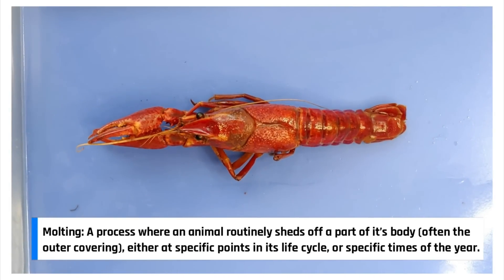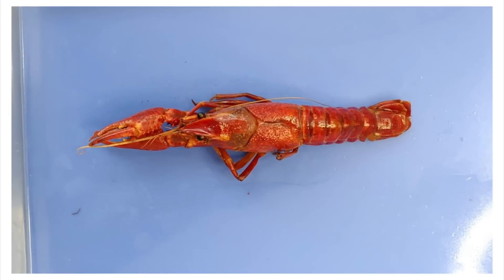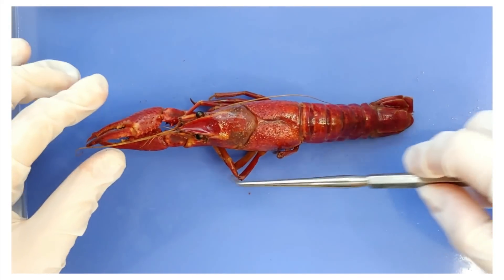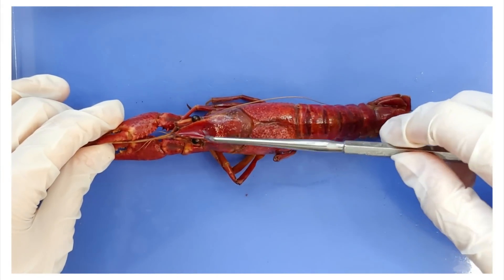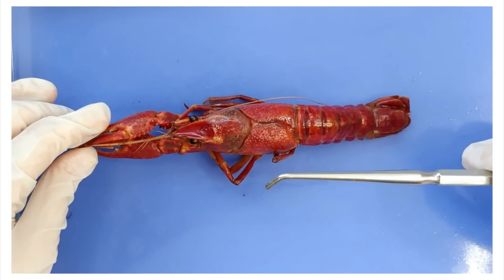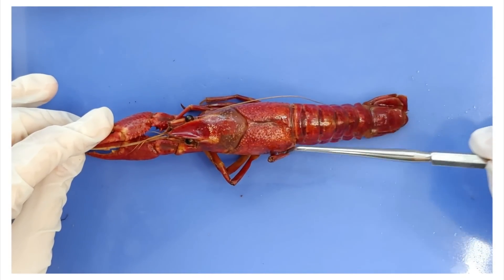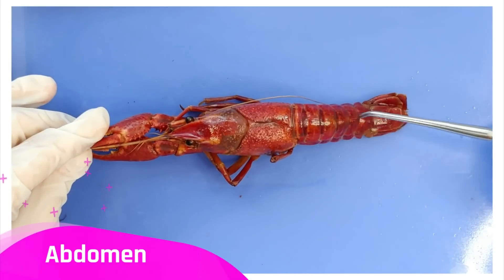Another characteristic of arthropods is having groups of body segments that are fused together to form a functional unit. These are called tagmata, and the crayfish has two of them. The top portion is called the cephalothorax, which is basically the two words cephalo and thorax mashed up together. Cephalo means head, and thorax means thorax, and the cephalothorax in a crayfish is basically the head and the thorax region fused together. The second tagma is the abdomen, right here.